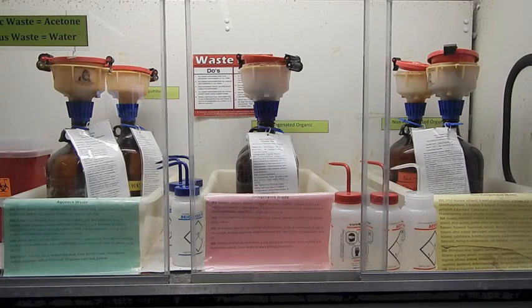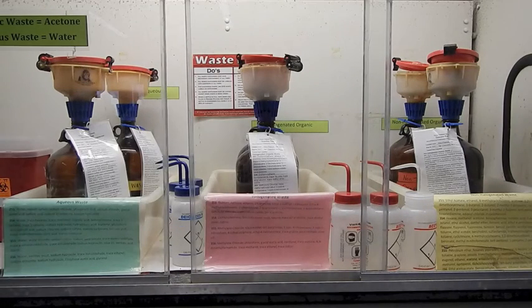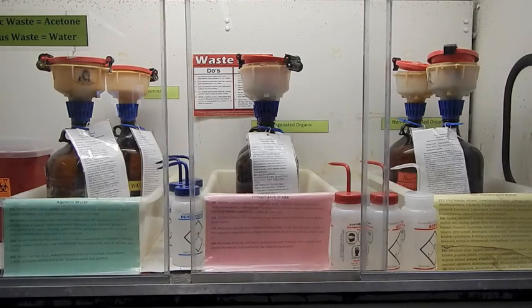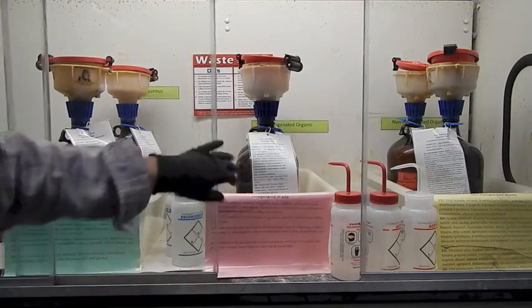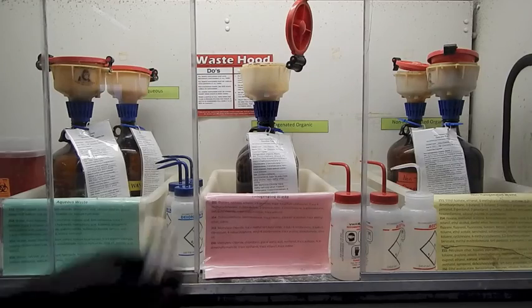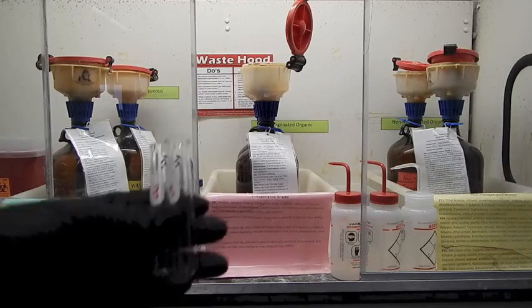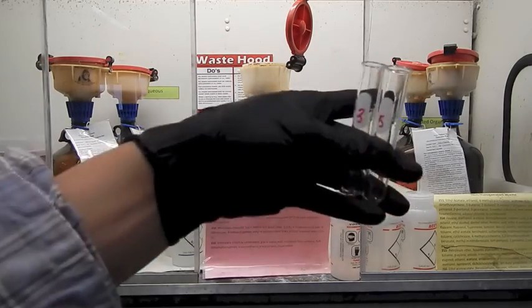For this lab, test tubes number 3 and number 5, those both have methylene chloride in them, so they're going to go into the halogenated organic waste. And all the rest of those, they can go in the non-halogenated organic waste because they're primarily going to be organic and there's no halogens involved. The last thing I want to mention about these is that these have lids, so you need to open the lid up before you pour your rinses in there. Once you've poured it in there, if you want to give it one more little wash with acetone, that's great, and that can go into the non-halogenated waste.